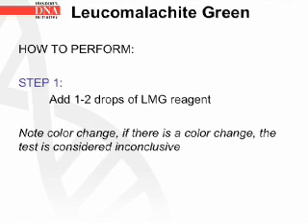Step 1. Add 1 to 2 drops of the LMG reagent. Note if there is a color change. If there is a color change, the test is considered inconclusive.